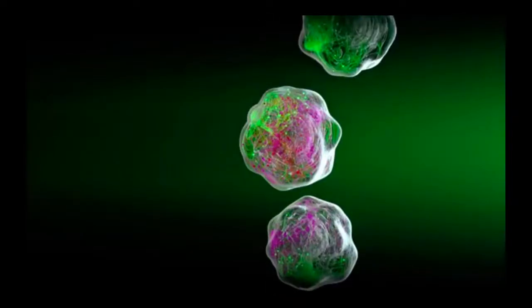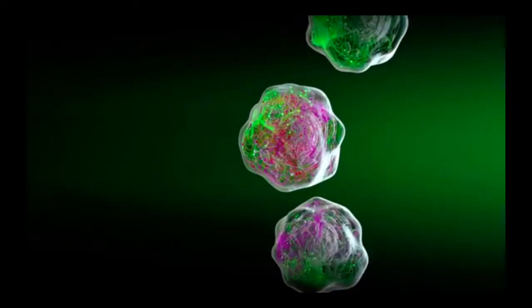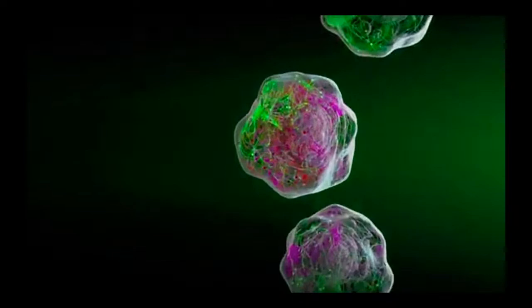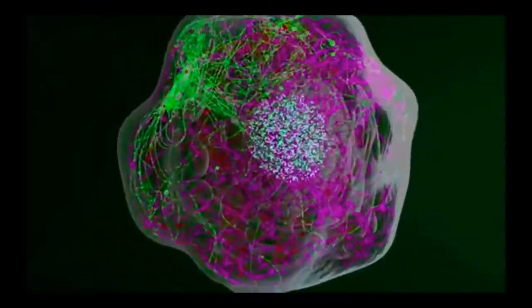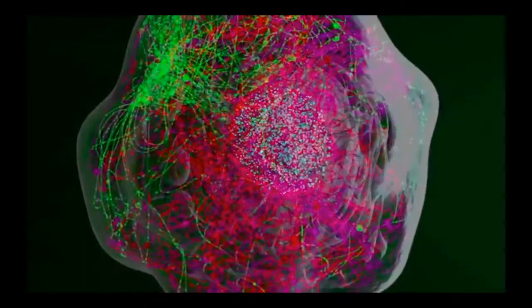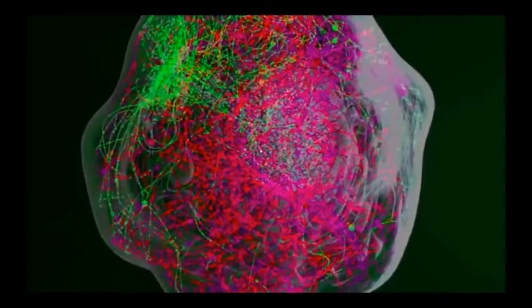Flow cytometry is a laser-based technology widely used to phenotype cells using antibodies directed against surface markers. It can also allow simultaneous analysis of multiple intracellular targets using antibodies that detect signaling proteins, their post-translational modifications, epigenetic modifications, and downstream transcription factors.